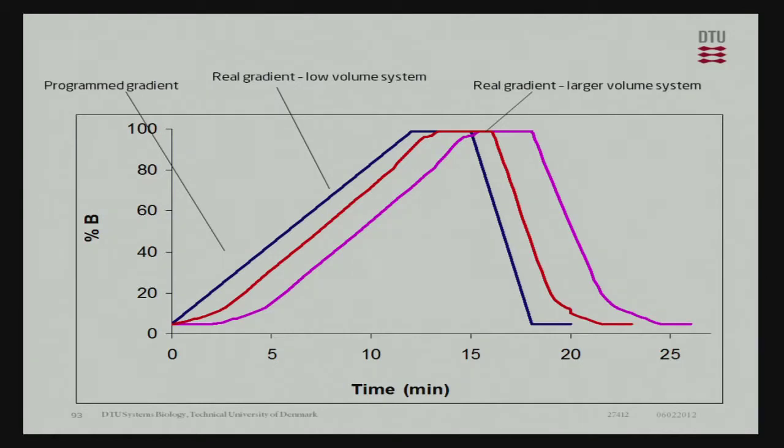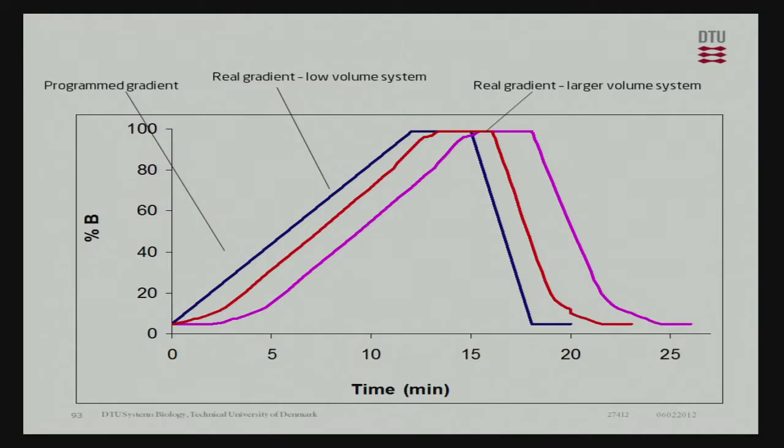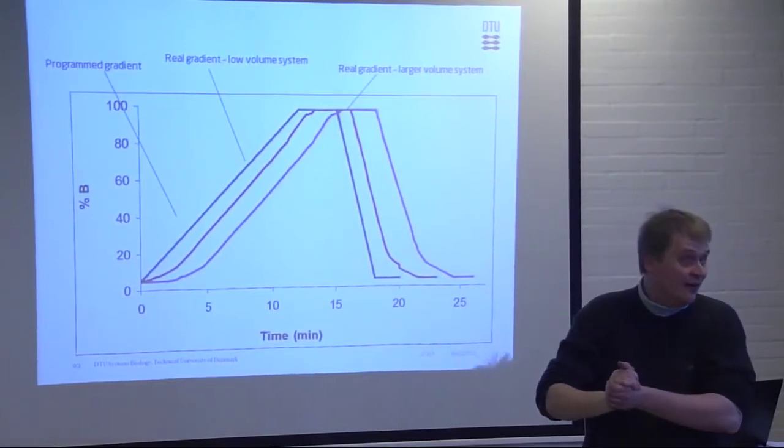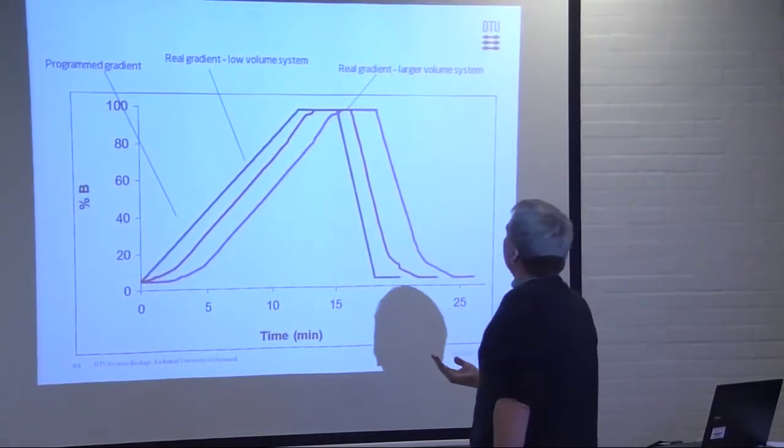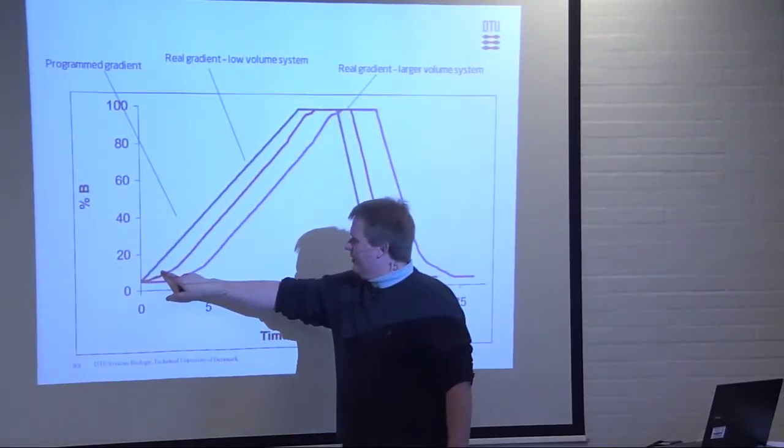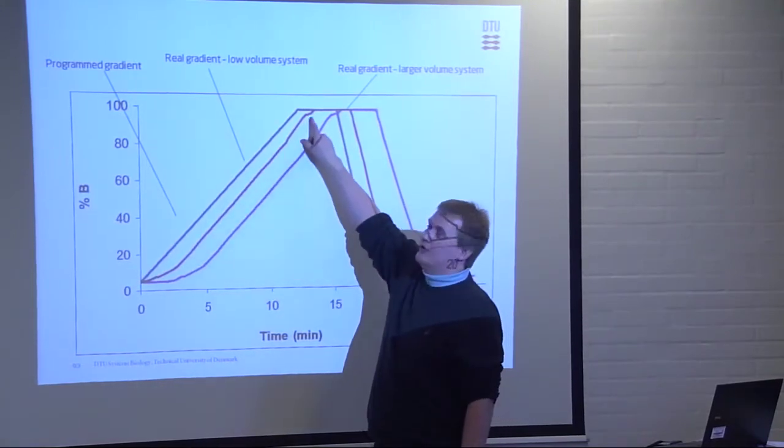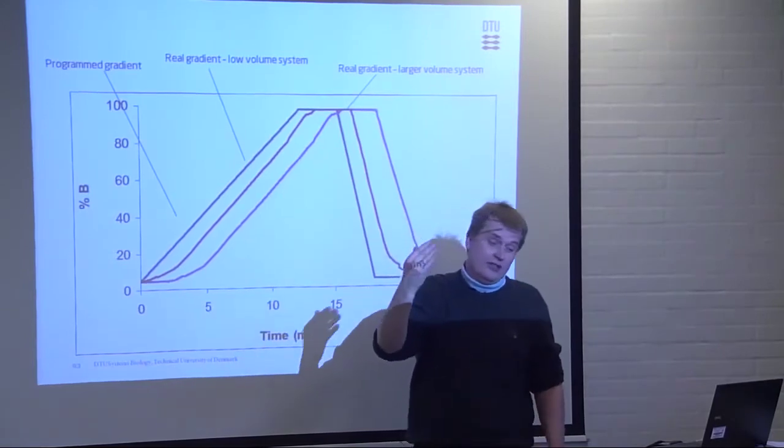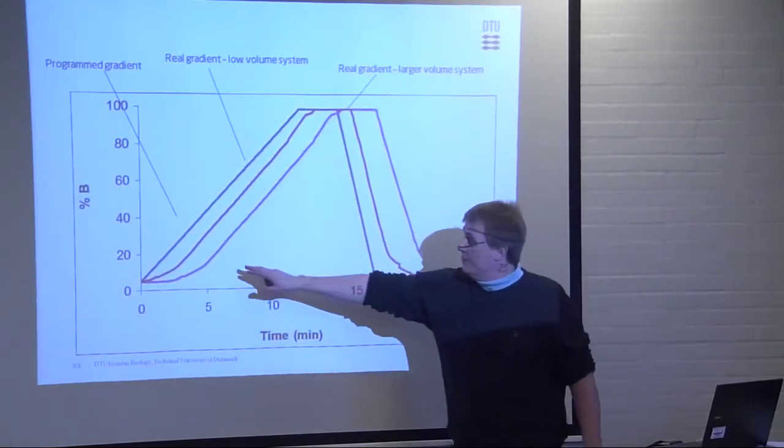So again, this is the easy one. This is the one, the blue one here. This is the one you just type into the computer, and then you think, this is what I get. The red one, if you have a very modern system, is probably what you get. But if you have an older system, or a system where you just put in a bigger mixer, you could have the purple here.